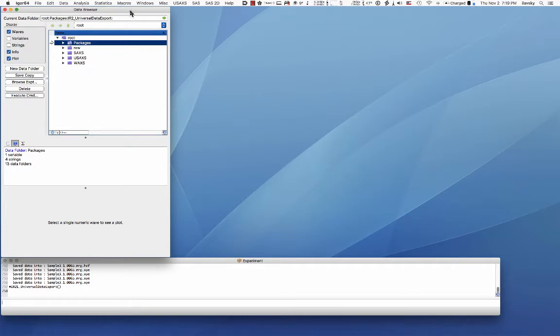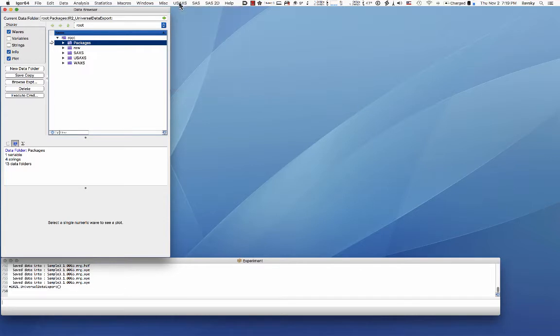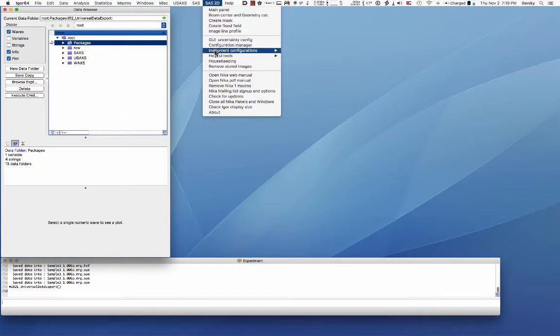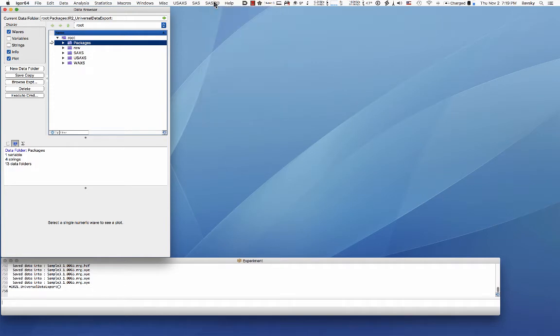Let's say that you have collected data on a USAXS instrument and used the USAXS data package Indra to reduce the USAXS data into a useful data set, or you used NIKA package which is the SAS 2D package to reduce data either from my instrument or from your instrument or some other device.